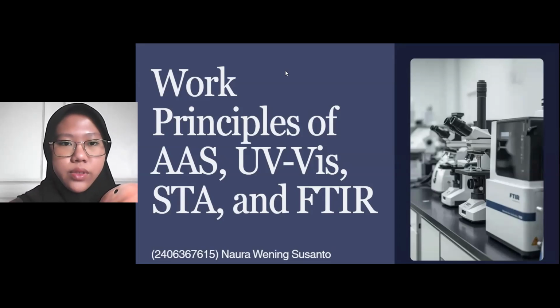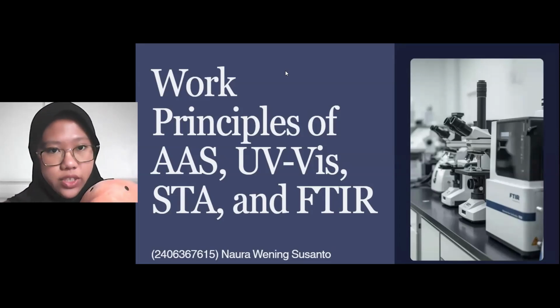Today, I will present to you the working principles of AAS, UV-Vis, STA, and FTIR.